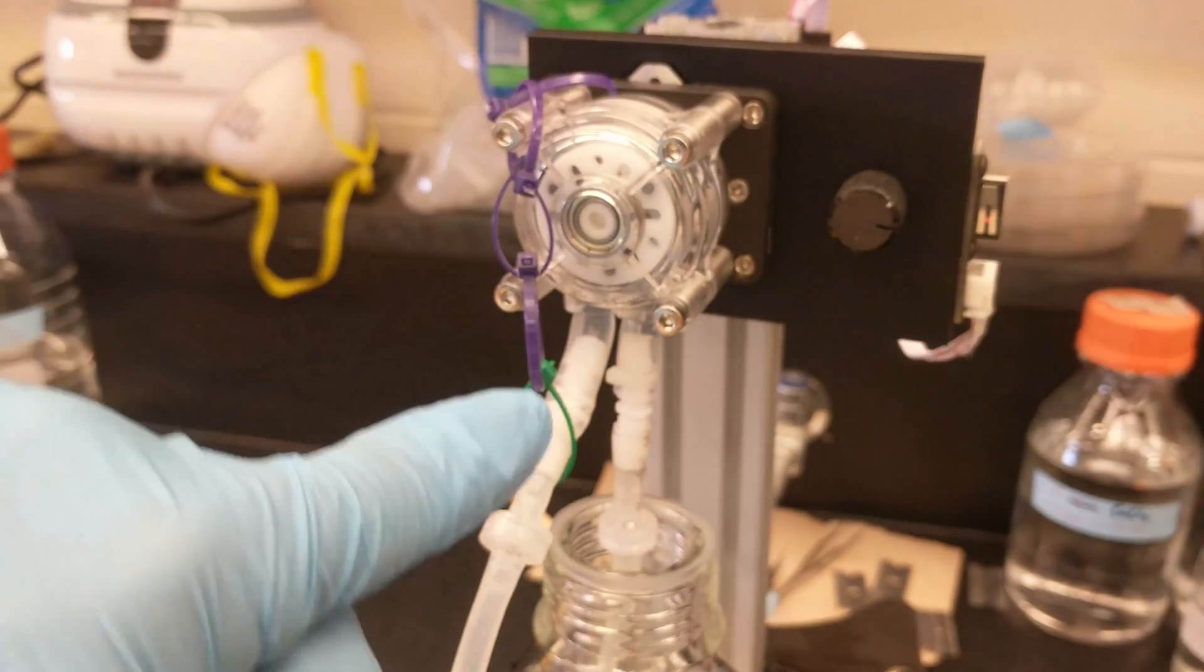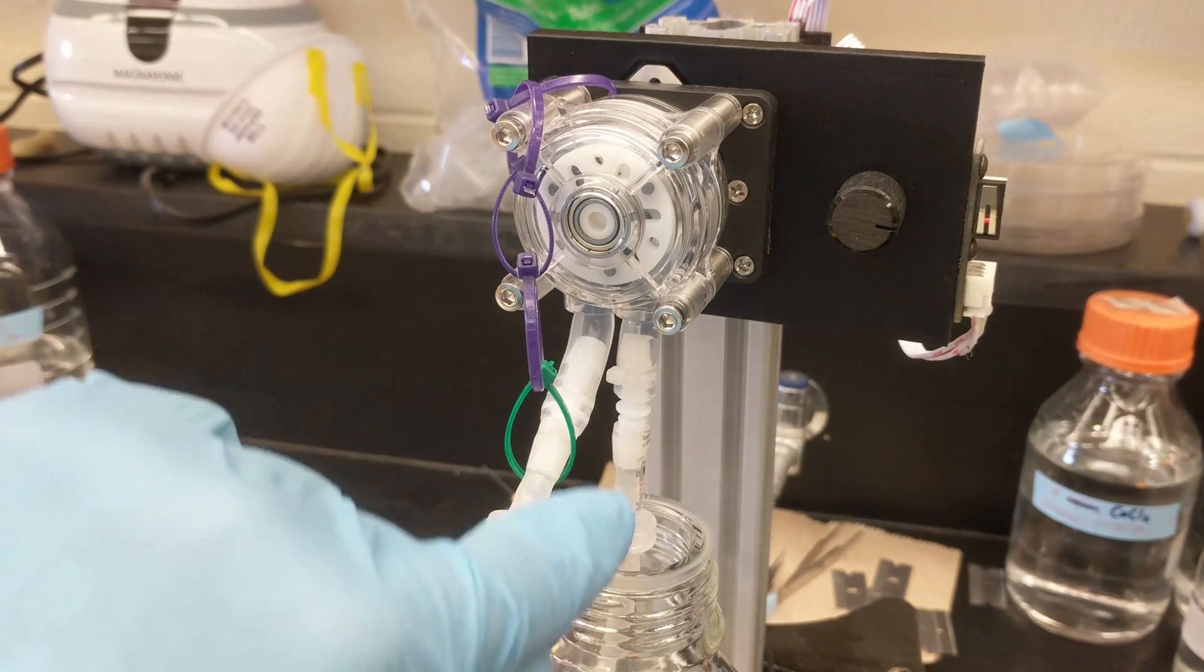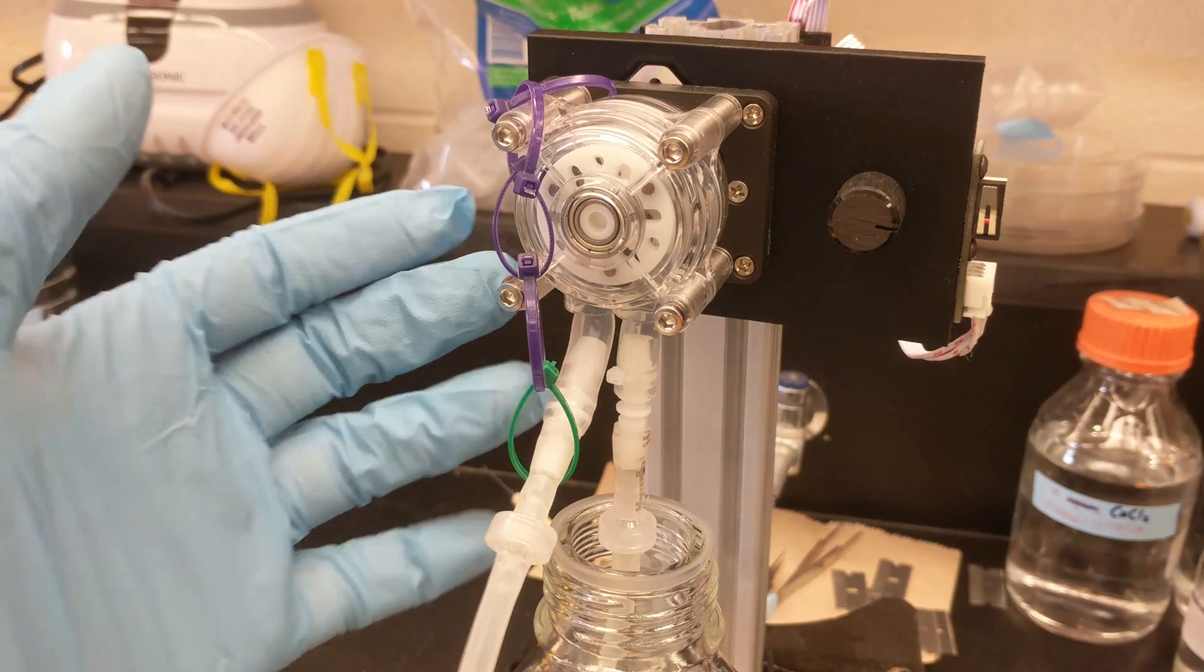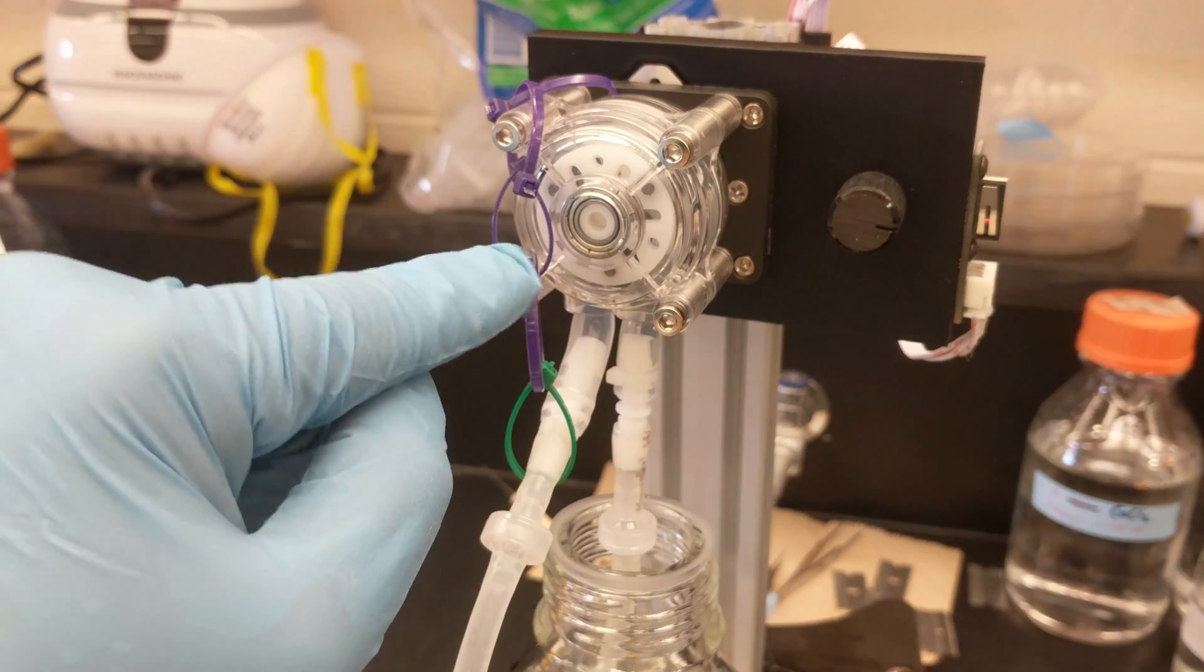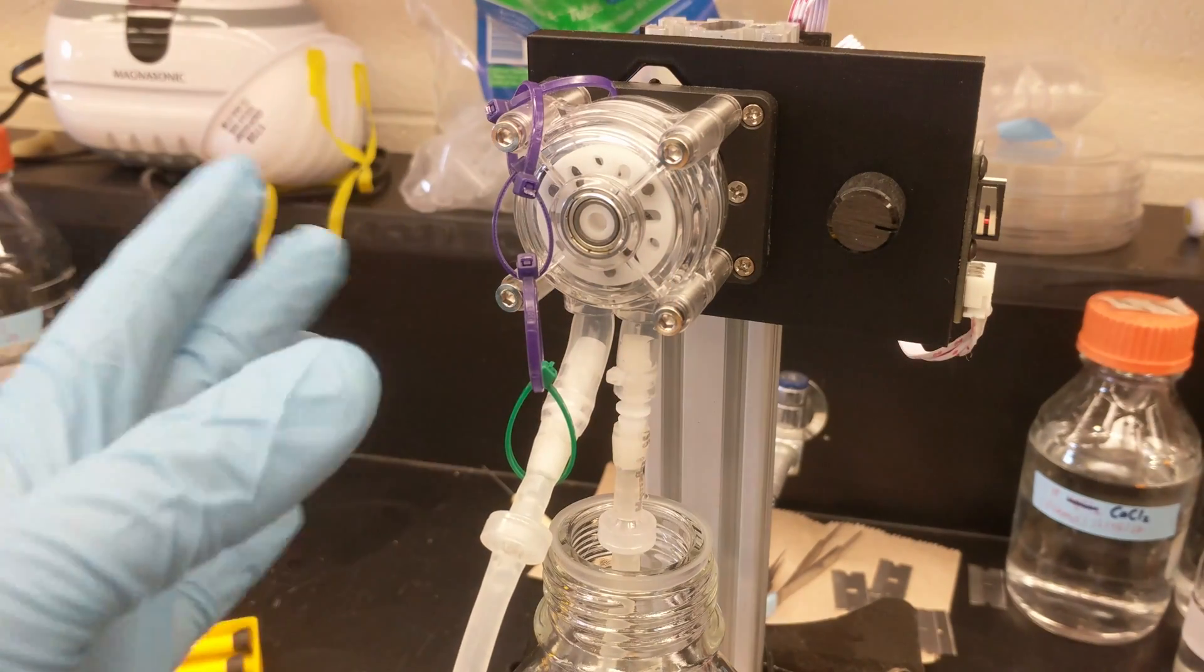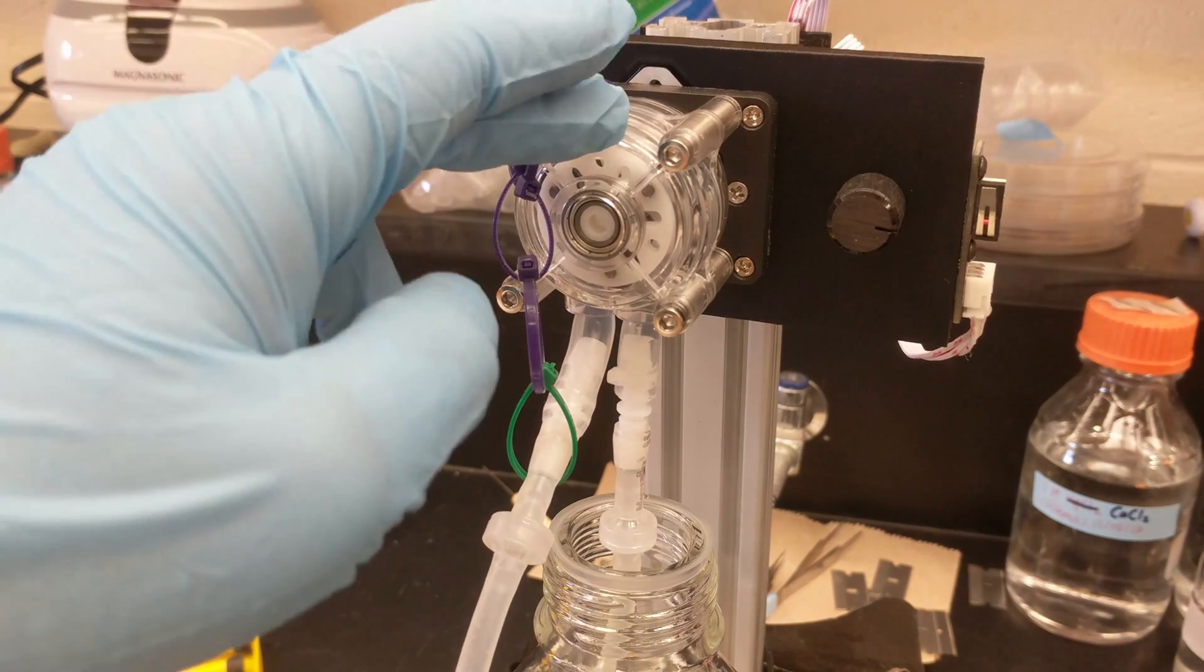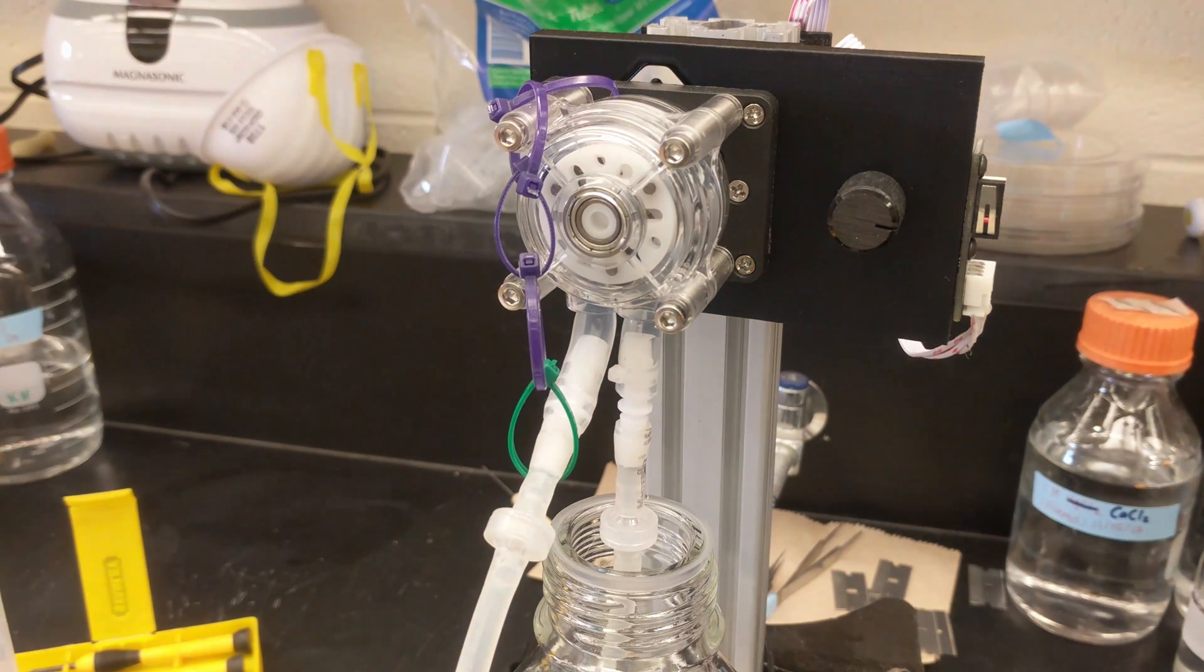And just as an aside, the interesting part about these types of pumps, peristaltic pumps, is that essentially the liquid that goes through the pump never actually touches any part of the motor itself. It's all self-contained within the tube that goes through the motor. And therefore if you want to keep your liquid sterile, then this is the pump for you.